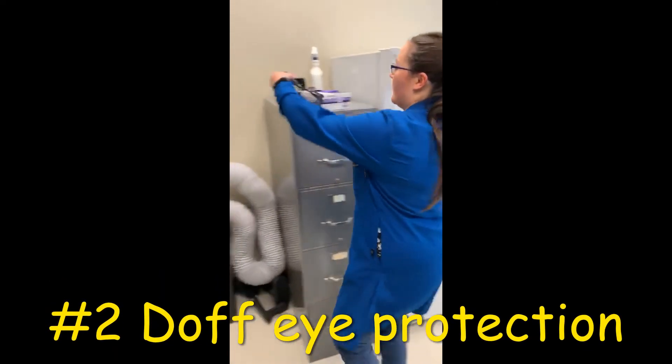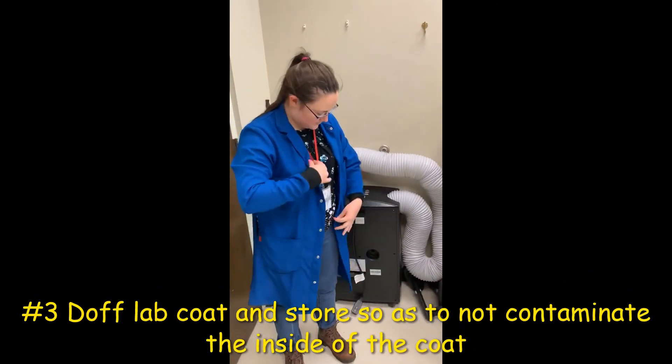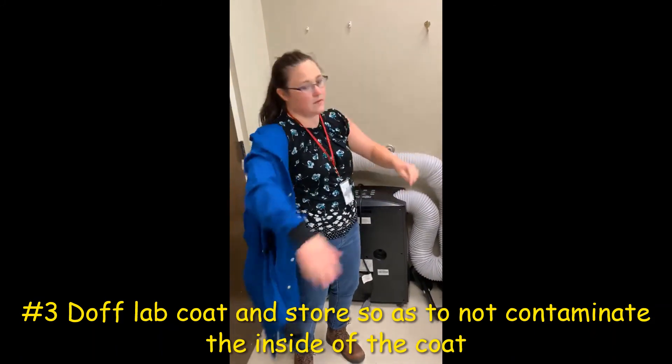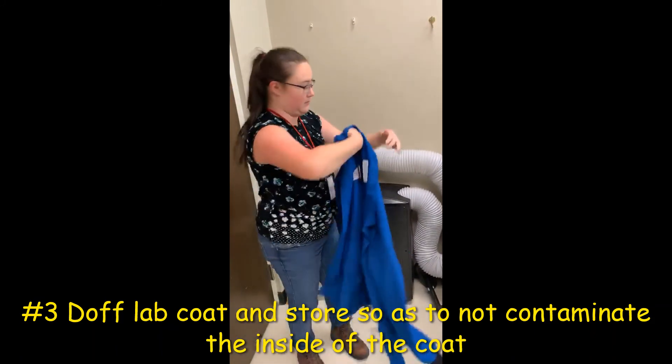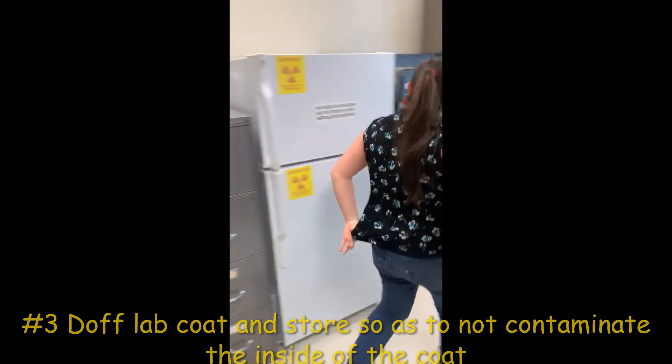Step two: remove your eye protection by the earpieces. Lastly, remove your lab coat by only touching the interior surfaces. Ensure that you store it in such a way so as to prevent contamination of the inside of your coat.